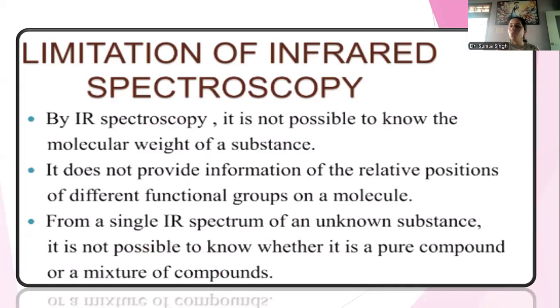That's why we have to go for other additions. We have to confirm any type of compound through IR, UV, mass spectra and other spectral techniques. IR spectroscopy individually can't confirm that compound. So this is the gist of my lecture on the topic of principles of IR spectroscopy.